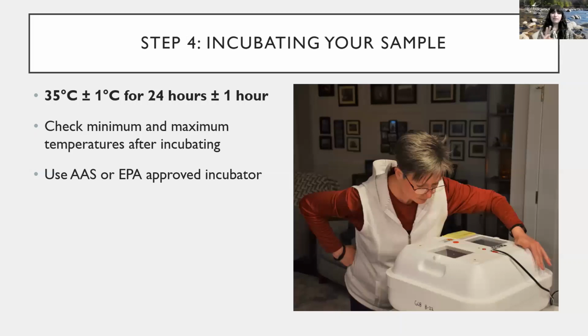Play around with it before you actually start collecting your samples, because you're going to need to preheat this incubator to about 34 to 36 degrees Celsius. And you're going to place your plates into this incubator to incubate for 24 hours, give or take 1 hour.